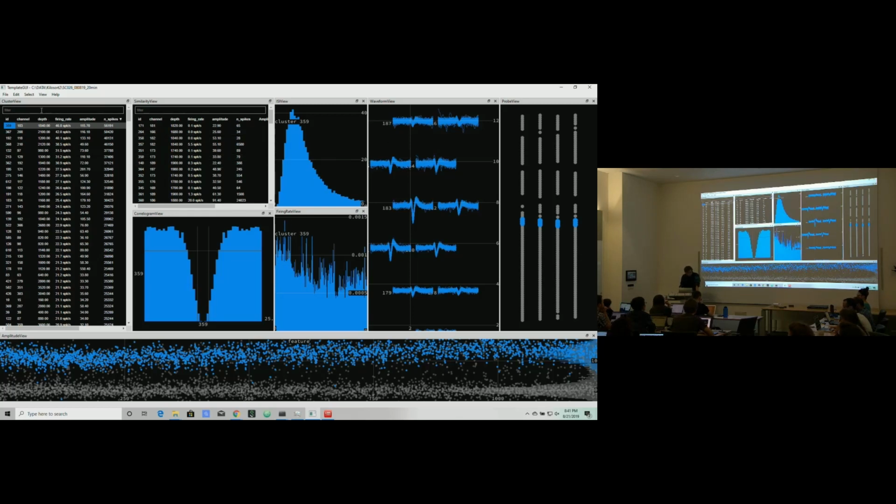And what are these views? Well, there are two lists. There's a big one, which is just the list of all the clusters, and there's a small one, the similarity view. If I'm doing manual curation, I want to go through my list, label things as good or bad, and inspect them closely, one neuron at a time. The one neuron I have selected here has ID 359.